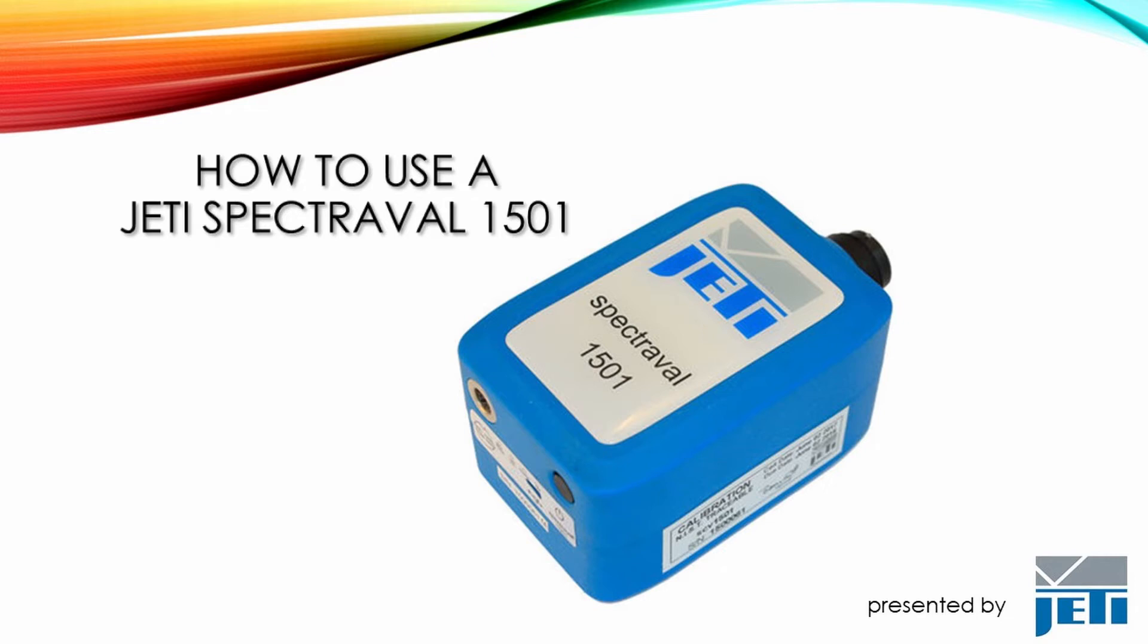Welcome to the tutorial of how to use JETI SPECTRAVAL 1501.